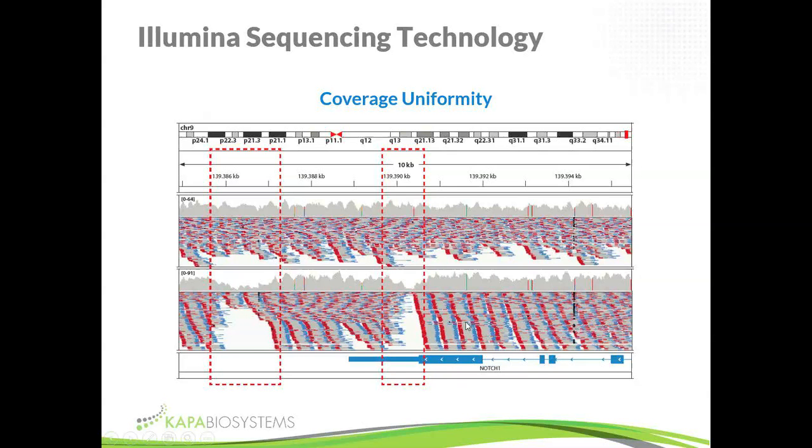The reasons we see low coverage in certain regions are because of the structure of DNA, inefficiency or limitations of library construction technologies, cluster amplification, the sequencing technology itself, and even some of the analysis aspects. Whenever we are missing regions or have regions that are covered below the threshold needed for the objectives of the project, it means we have to sequence more. And sequencing more obviously costs more.